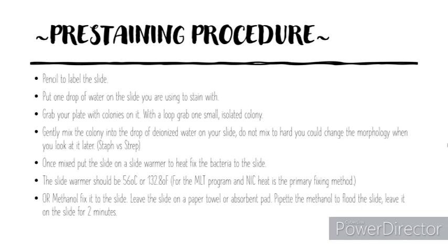I don't think we've ever used methanol to fix bacteria to the slide, but I have seen videos and people at my internships do this method. So usually if you want to methanol fix it, you'd leave the slide on a paper towel or absorbent pad and pipette the methanol to flood the slide, and then you would leave it on the slide for 2 minutes.